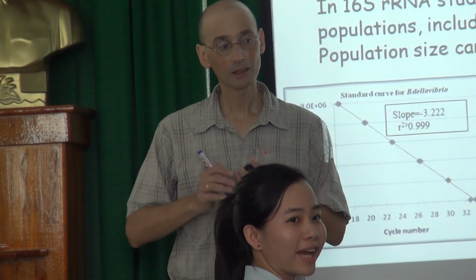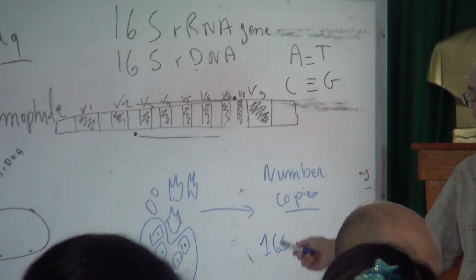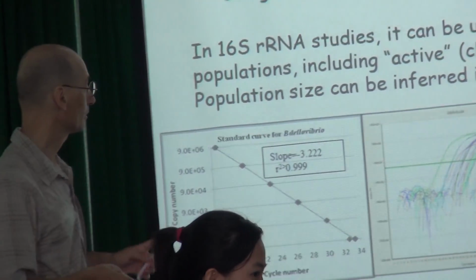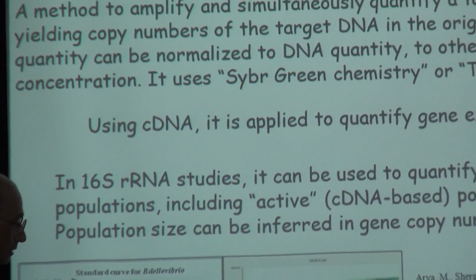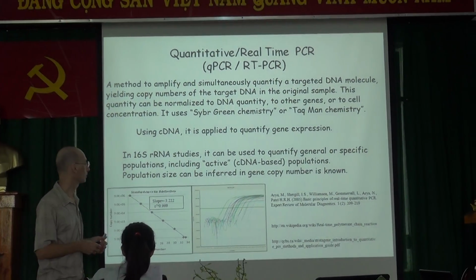So these are the kind of things. Sometimes you know, sometimes you don't know, but you can still compare different samples. So it's a very efficient and very powerful technology. Of course, all this needs a lot of standardization, but if one wants to try qPCR, we learn very easily.